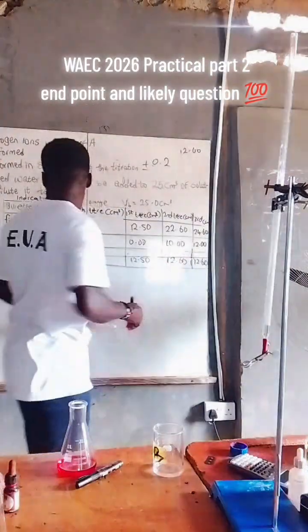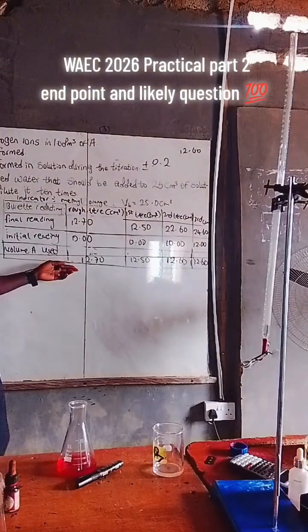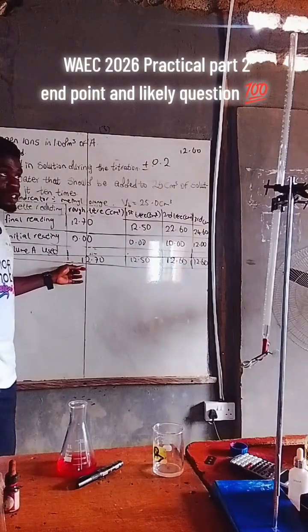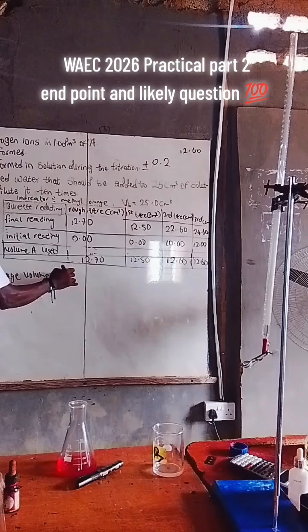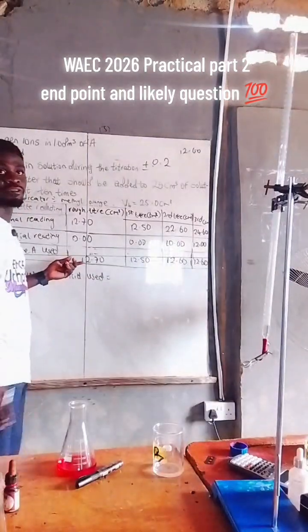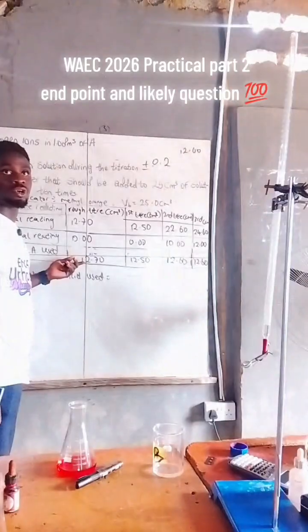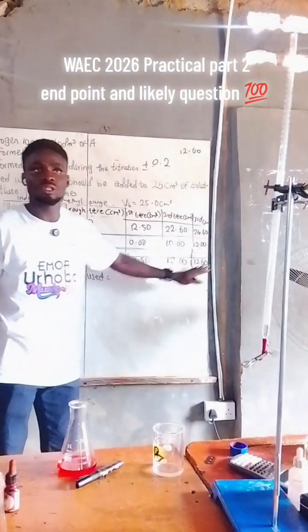It's still fine. So, you have to find the average volume of acid used, abi. So the average volume of acid used will be what? Will I add it off? No. I will add the first, the second, and the third, right?